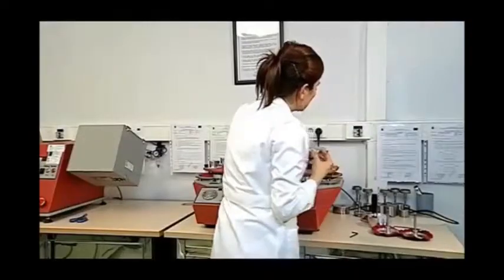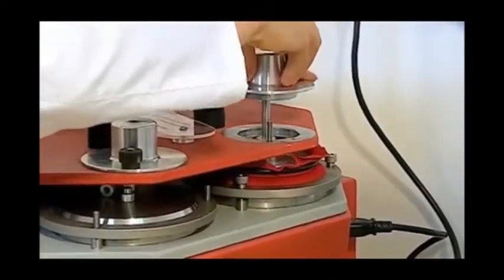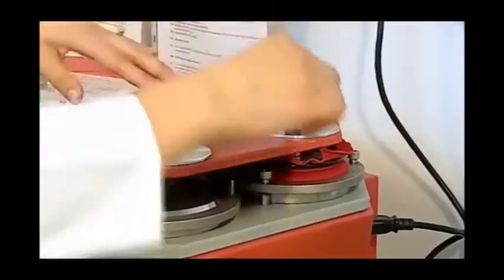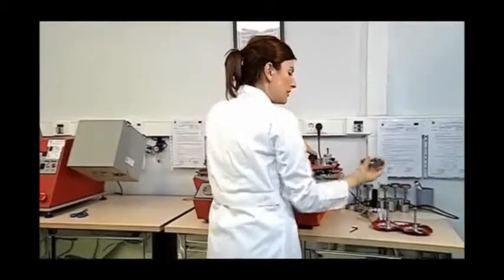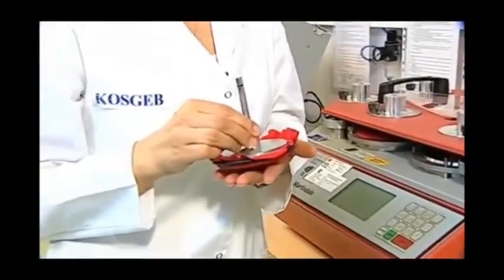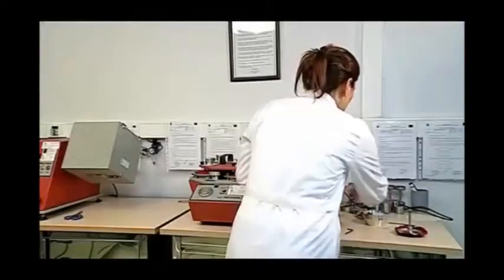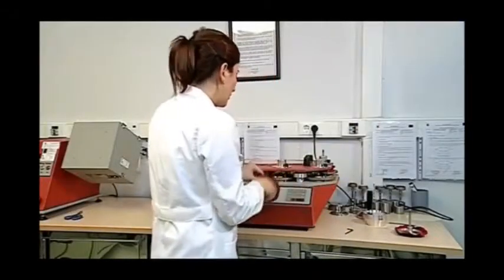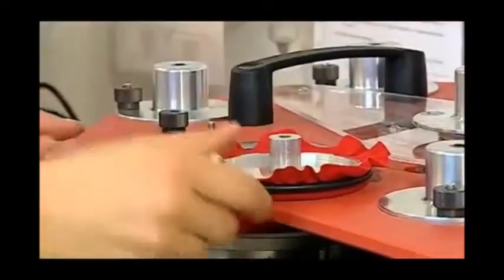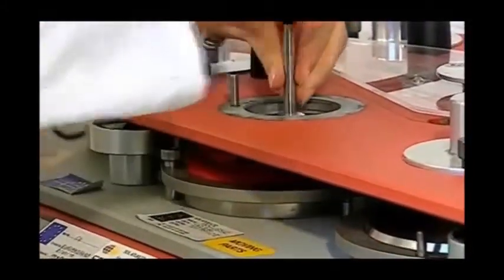The total weight of the sample is 155 grams for knitted fabrics. For woven and upholstery fabrics, a weight of 260 grams is put on the sample holder and a pressure of 415 grams is exerted. We do not put the weight because it is a specimen fabric. We place sample number 3 in a way that the abrasive surface faces the surface of the sample on our table.